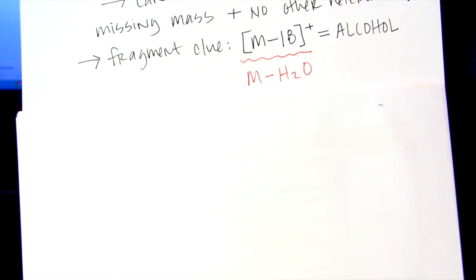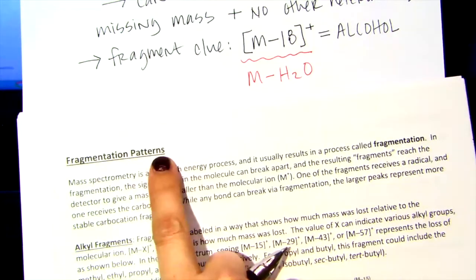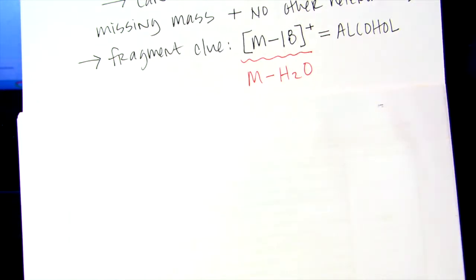Okay, so if you go to the next page of your handout, page 5, it goes into more detail about the fragmentation patterns. What you take away from fragments is that it's just your molecules falling apart in the mass spec, and then it can give you some little hints about pieces of your molecule. But you don't want to spend a ton of time analyzing the fragments, because usually if we're structure solving, we're also putting that together with NMR, right?